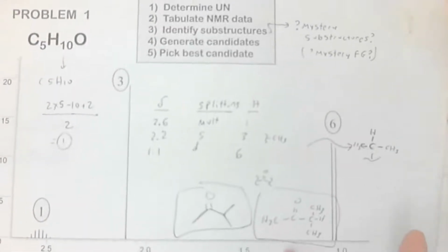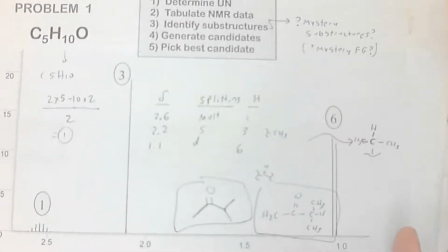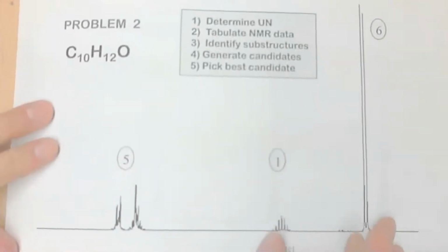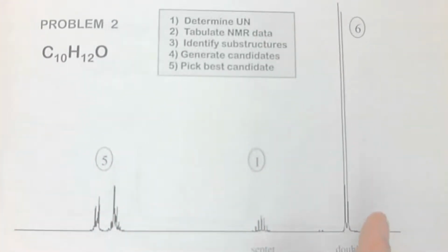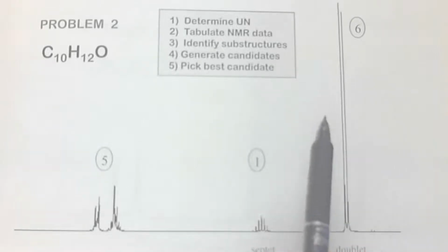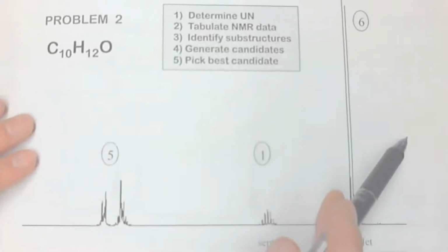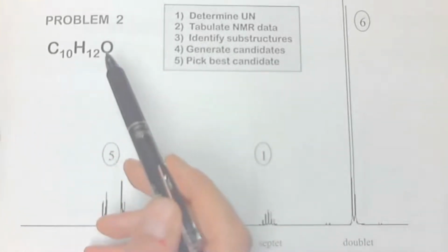Fun. Let's do the next one. Any questions on this? It's a pretty easy one, and they get a little harder, but this is a good start. All right, number 2. All right, so UN. First start with UN. Remember that oxygen you ignore.